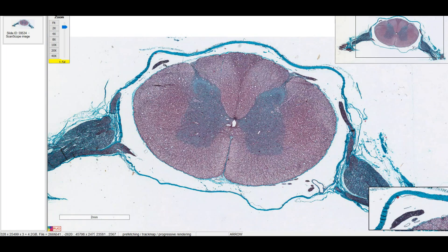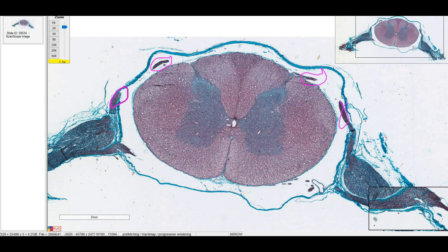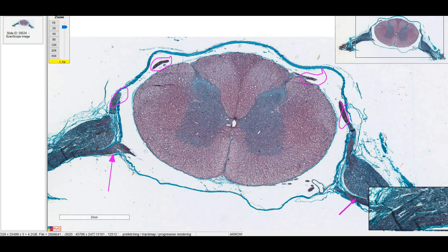Now let's look at the rootlets. We have some dorsal rootlets here. And the ventral rootlets are down here. Remember the ventral roots don't actually connect with the cells of the dorsal root ganglion here. They just kind of ride together with the axons of the DRG.